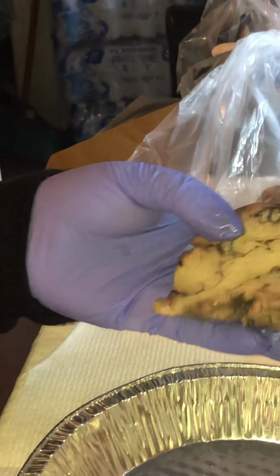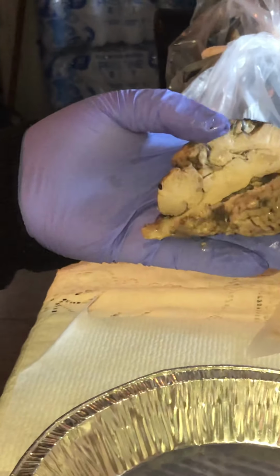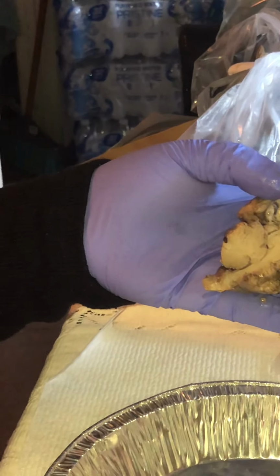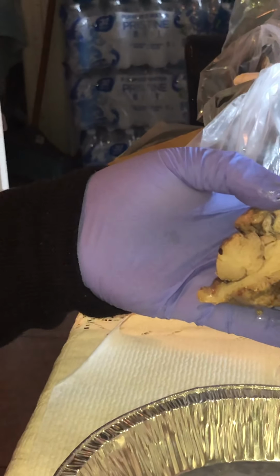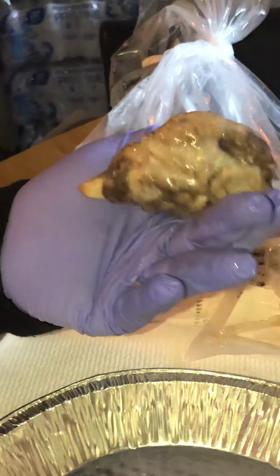Okay, so then we have the optic nerve. I'm sorry, we already did the optic nerve. Okay, let me see. What am I missing? I'm going to have to cut this thing in half.